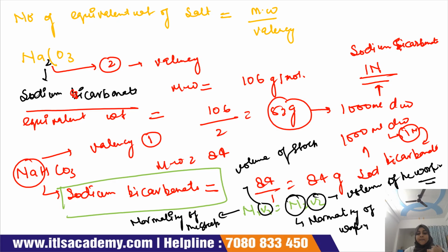So we completed two topics: one is molarity, or molar solution, and another one is normal solution, or normality. Now the next is the percentage solution. Percentage solutions are prepared either by weight by weight, weight by volume, or volume by volume.